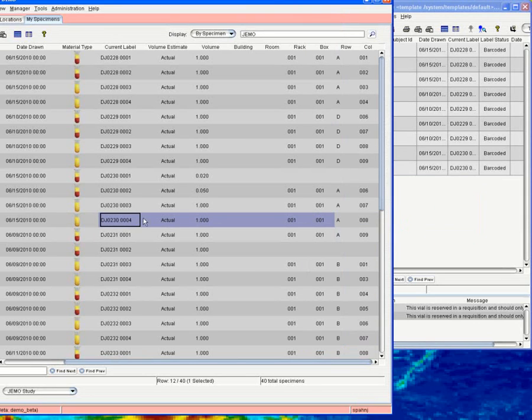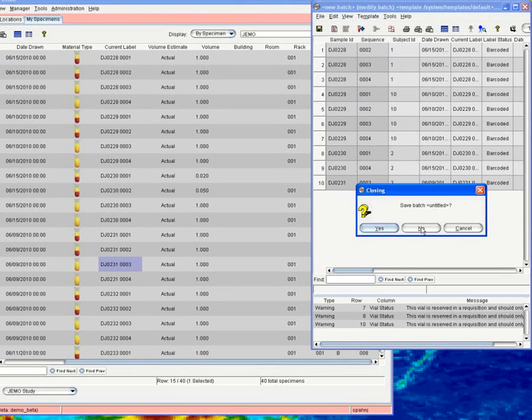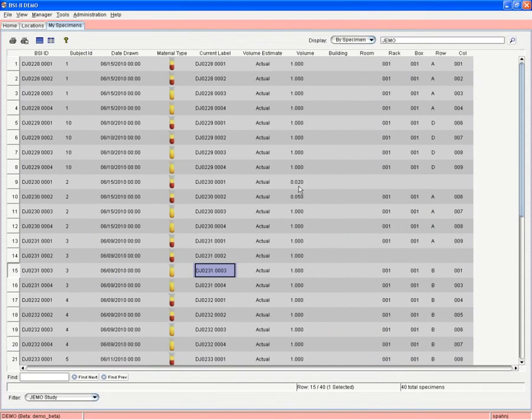You can click and drag records into tables now. So I can, let's do it again. I'll click from here, kind of hold down, and then drag it into the mod batch. So I can add specimens to my mod batch that way. I'm going to go ahead and close this mod batch and open up My Specimens again. Go back to the right mouse button menu.